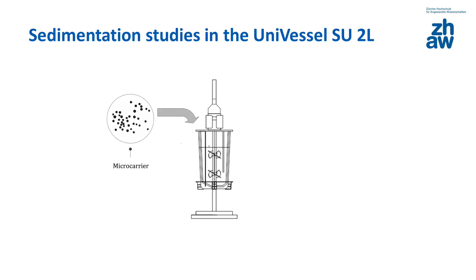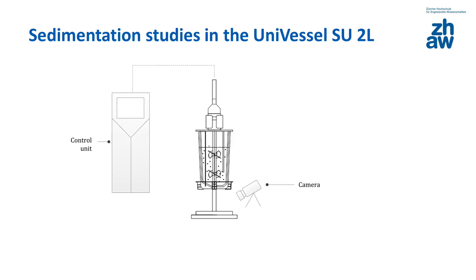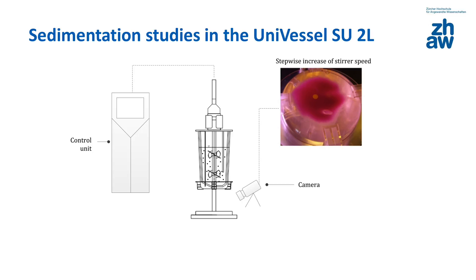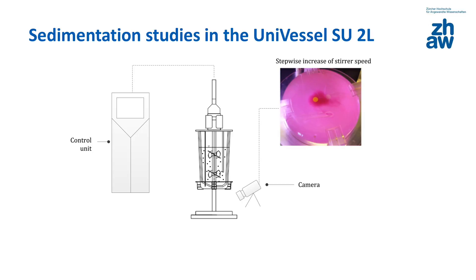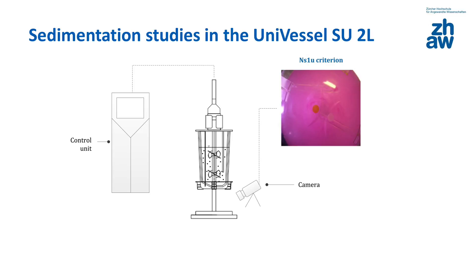After the bioreactor has been installed, the first concentration of microcarriers is added to the medium. A camera is used for documentation purposes and also enables suspension characteristics of different microcarrier concentrations to be compared. The impeller speed of the reactor is regulated with a control unit, Biostat B+. The impeller speed is increased incrementally. After each increase, the microcarrier movement is observed and the impeller speeds for the NS1U and the NS1 criteria are determined.